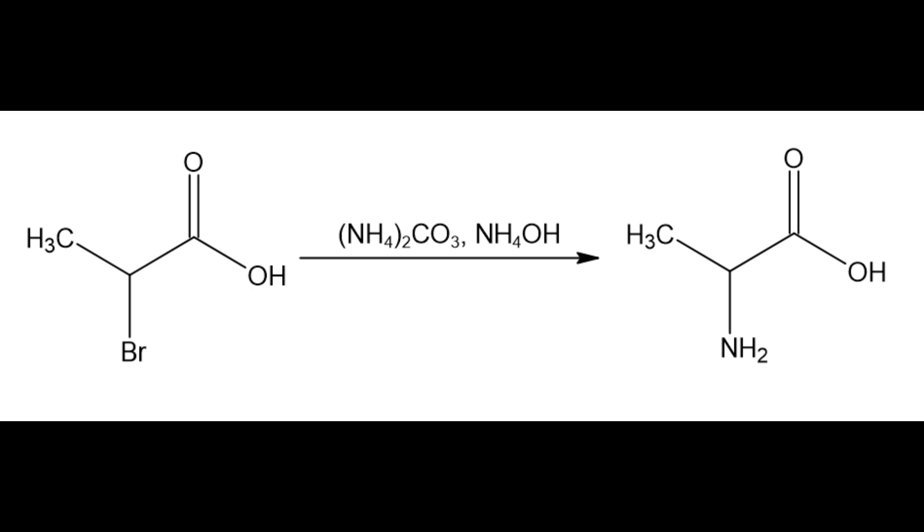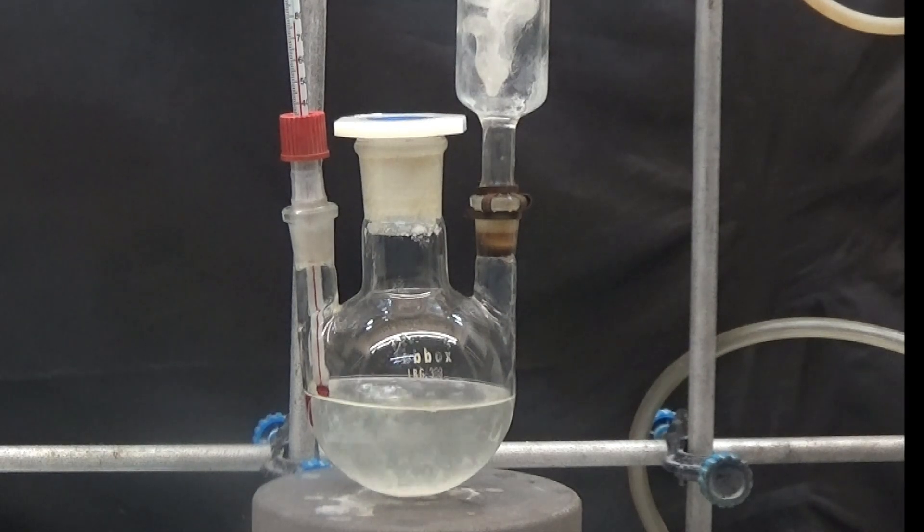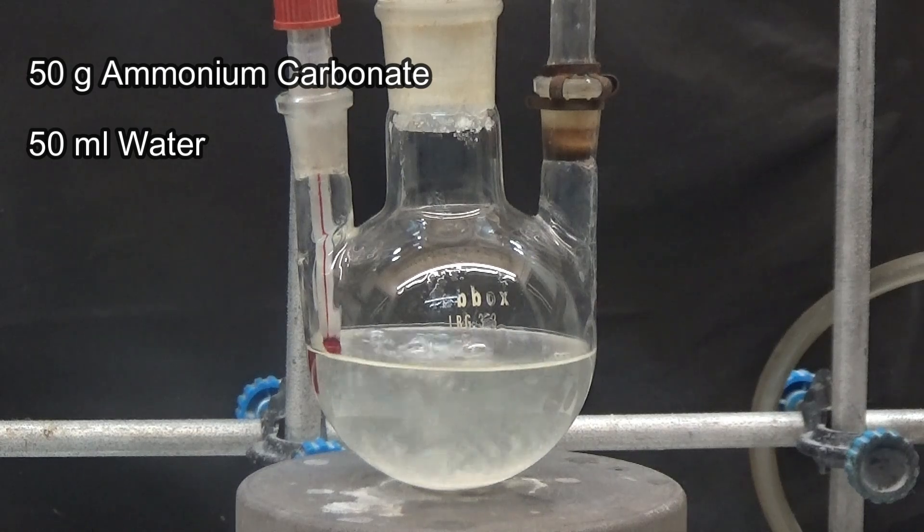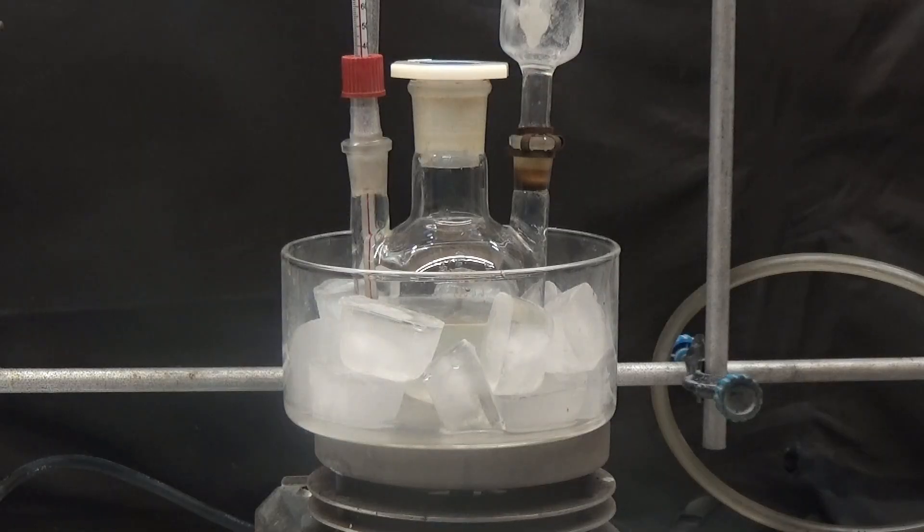We will work in a fume hood or outdoors due to the toxicity of the products used. In a 250 milliliter flask with a reflux condenser and a thermometer, we dilute 50 grams of ammonium carbonate in 50 milliliters of water. Heat to dilute all the carbonate, cool with an ice bath, and put 100 milliliters of 26% ammonia solution in an addition funnel.